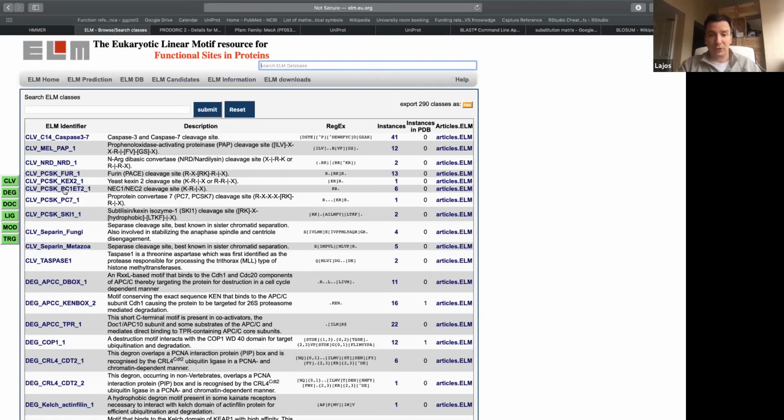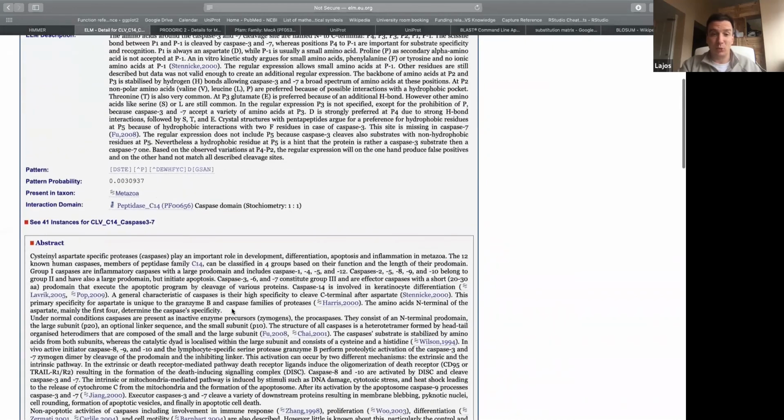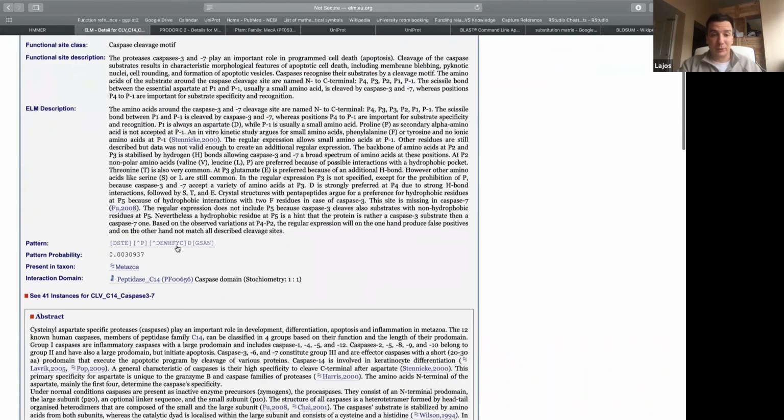But the most important thing here is that your sequence is defined completely differently from what we saw until now. There are these very small characters here, but I will just click on one of them. This is something we already discussed in very small detail when we spoke about string recognition during the R programming.